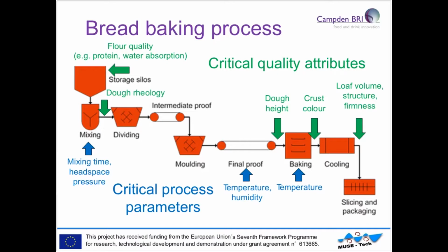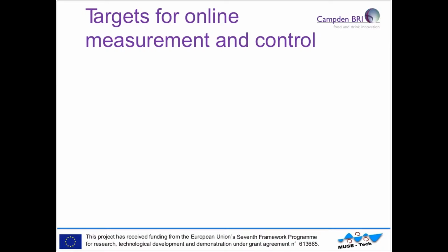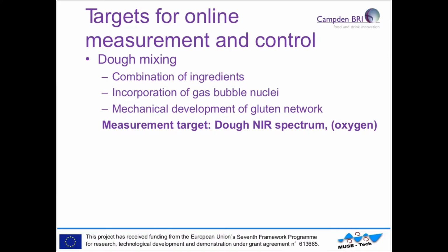Within the MUSE-Tech project, we felt that the sensors we have would be relevant for the mixing and the final proof processes, so that's what we will focus on. And we've picked out a couple of measurement targets that we think are relevant in these processes.